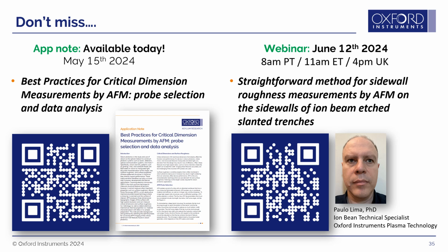Yeah, again, depending on how the samples are prepared, you might want to also look at the conductivity. One thing that you have to keep in mind is that you have to have the right probe if you want to do, for example, electrical measurements, and it just makes it maybe a little bit more complicated to choose your probe so that it's really sharp, really small half cone angle, and it's also conductive if that's what you're interested in measuring.